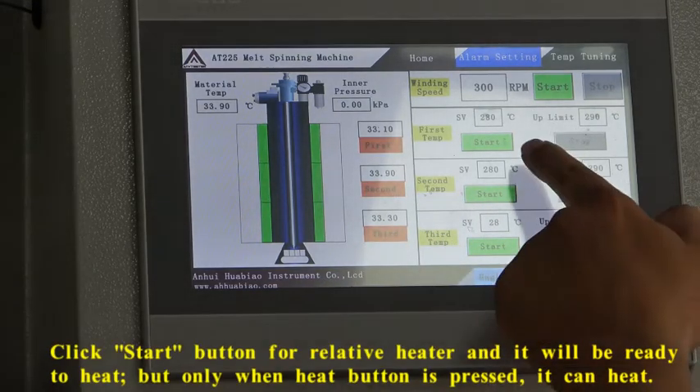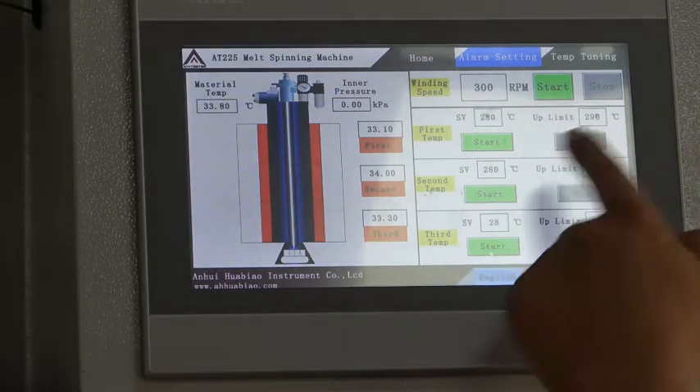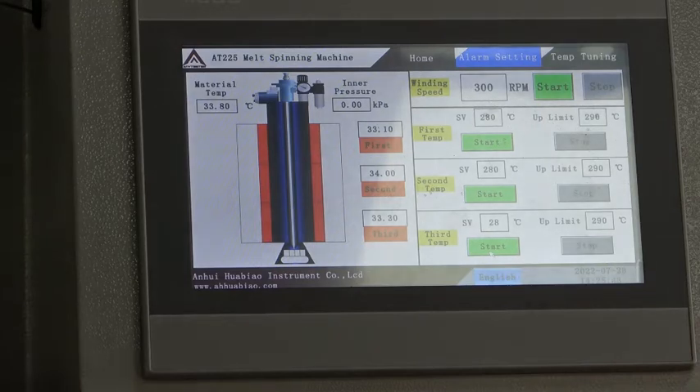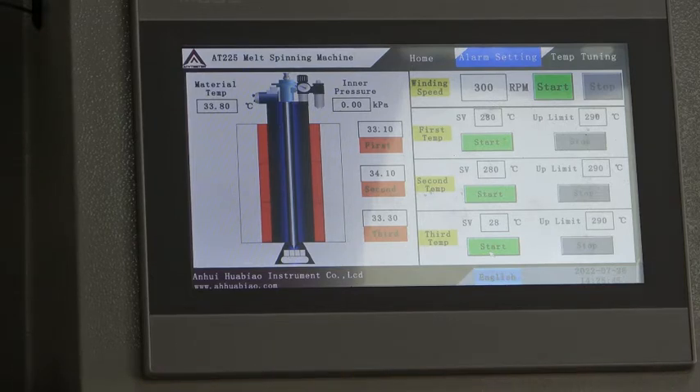Press the stop button, and the machine is ready to heat. Press the heat button. Now the machine is beginning to heat.